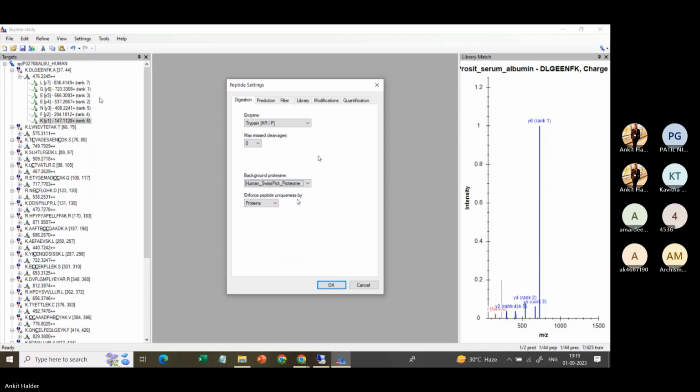It is the same concept as in Mascot, where we try to get the peptide sequences matched in the theoretical spectra along with the experimental spectra, and now we are doing it in the opposite direction.